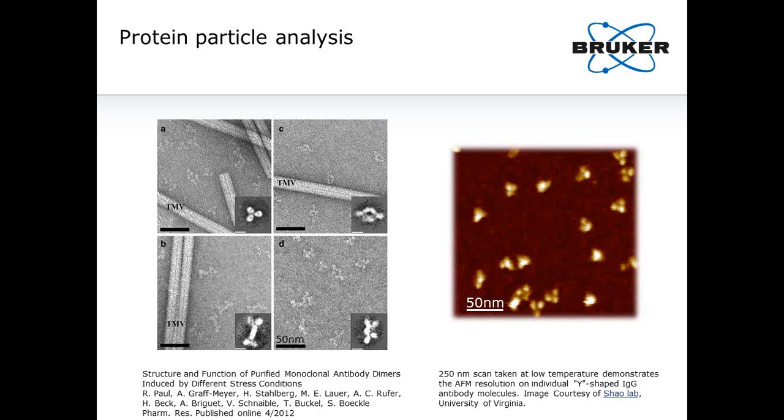In the growing field of biological pharmaceutics, therapeutic antibodies are mass-produced to serve as a drug substance. It can happen that some of the antibodies form complexes, for example dimers, and some of these complexes can be toxic. It is therefore important to produce and formulate these antibody solutions in such a way that complex formation, especially of toxic species, is minimized. This can be addressed through nanoscale imaging and subsequent particle analysis, as shown in this very recent paper from authors at Hoffmann-La Roche and the University of Basel.